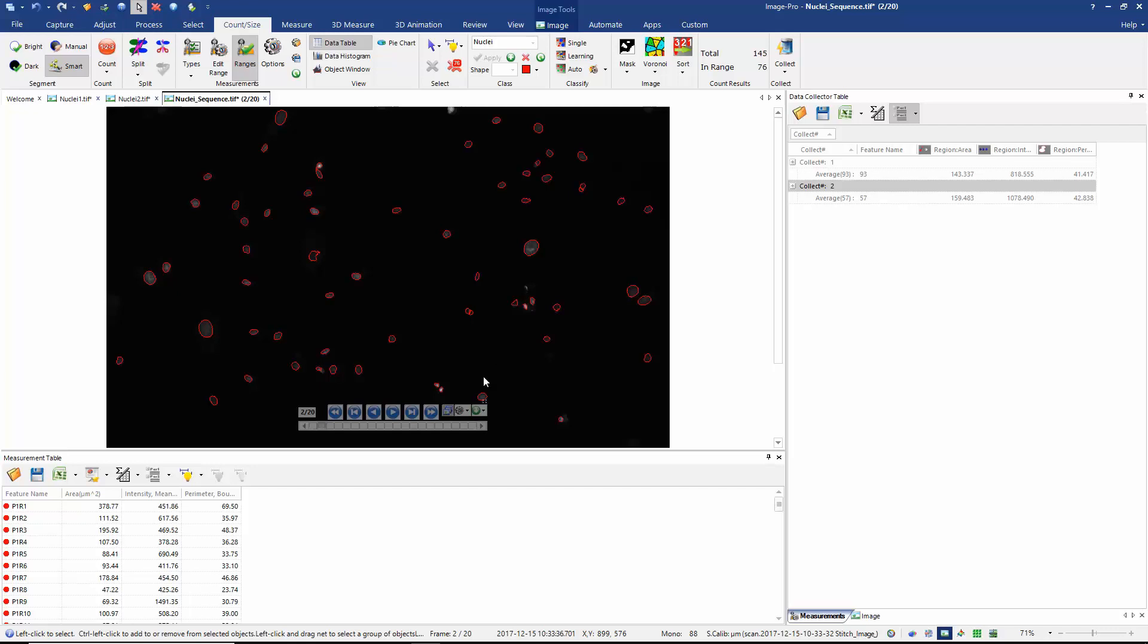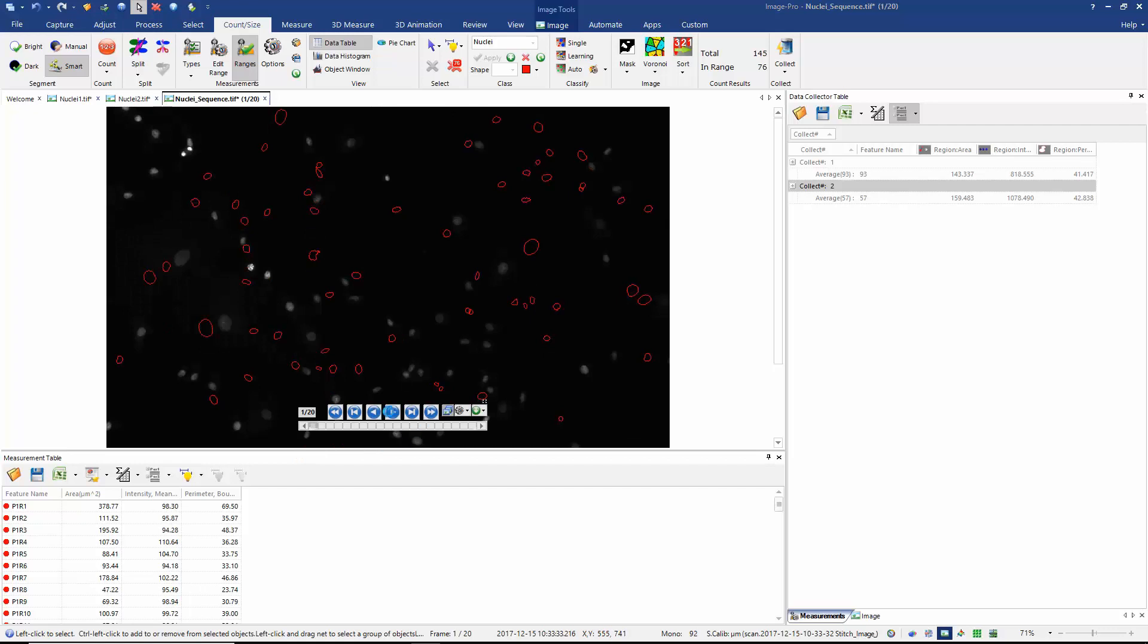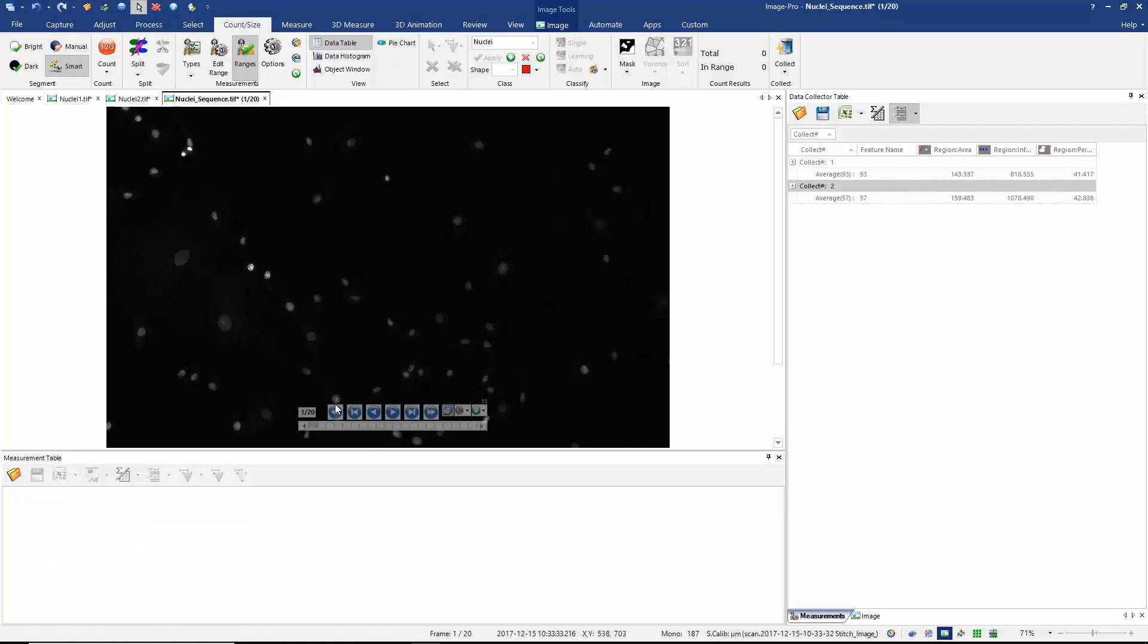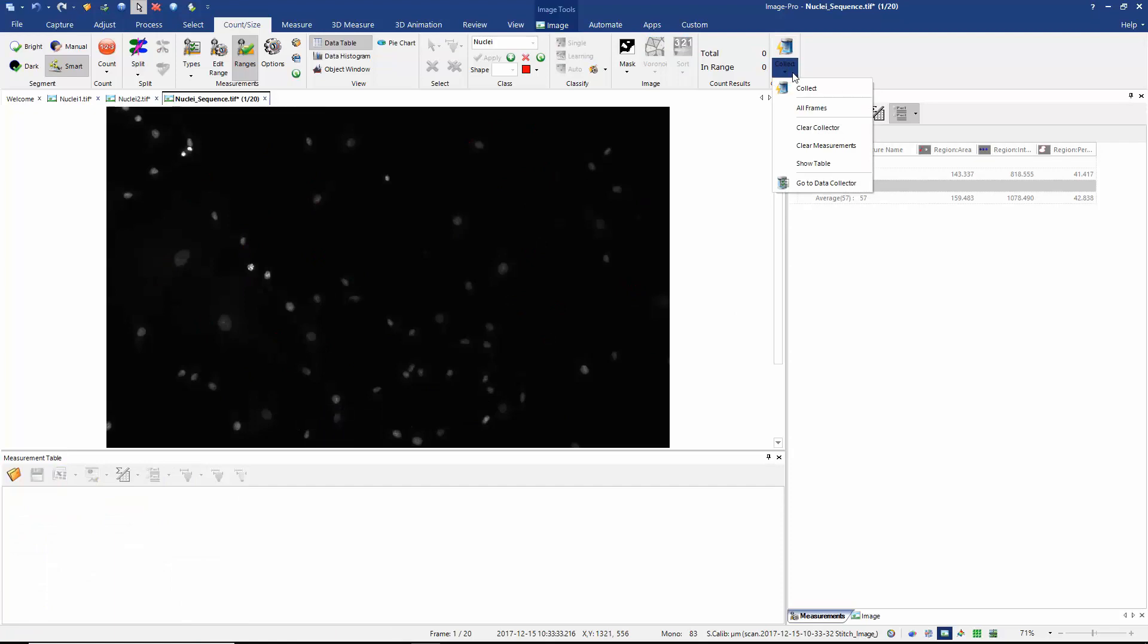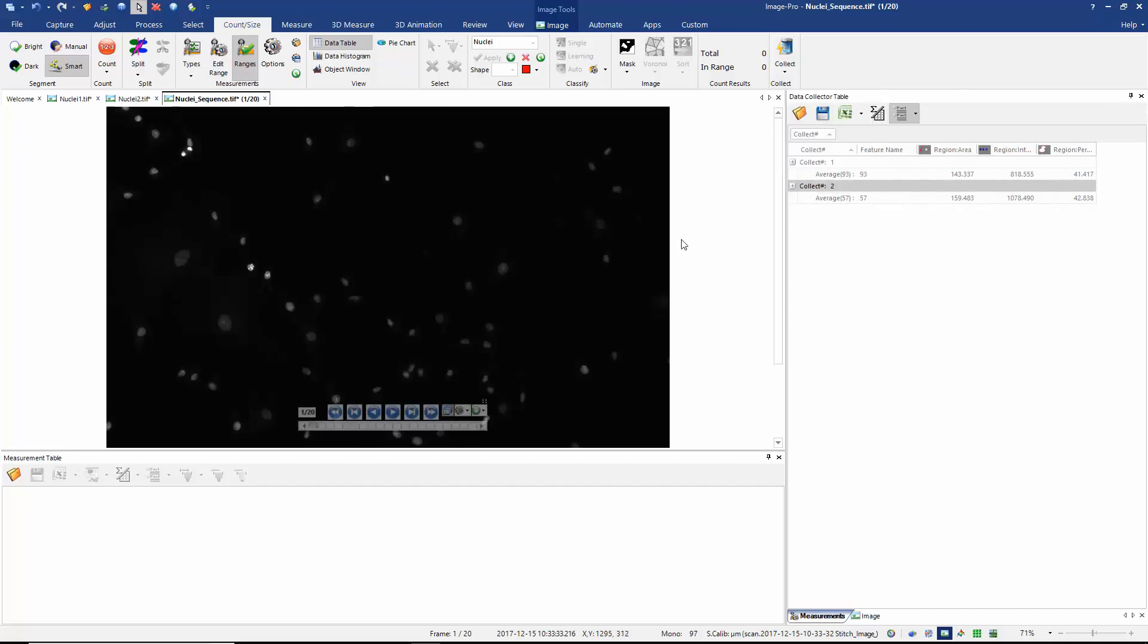We can actually use the data collector to measure all 20 frames automatically. So let's do that. Let's go back to frame one, we'll clear all our measurements. Now if I check the data collector I'm going to choose the option to measure all frames. I also want to clear the collector because I want to clear these measurements that are currently in my collector.